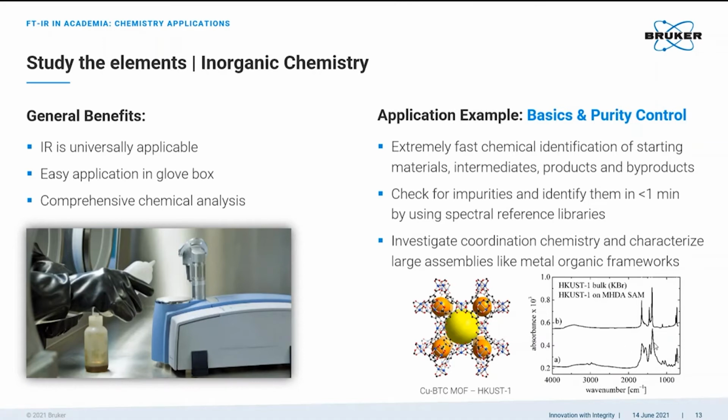Here, FTIR spectra have been taken for bulk and surface-anchored HKUST MOF. The identical absorption band positions show that the MOF has been successfully built on the surface of a carrier material without contamination.